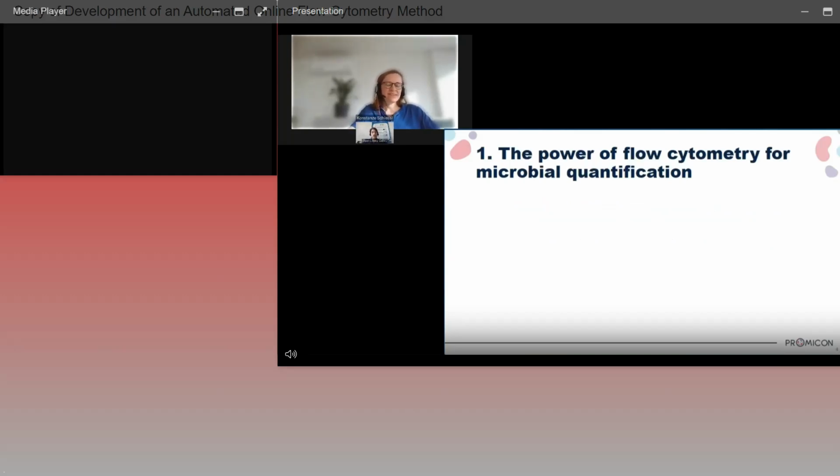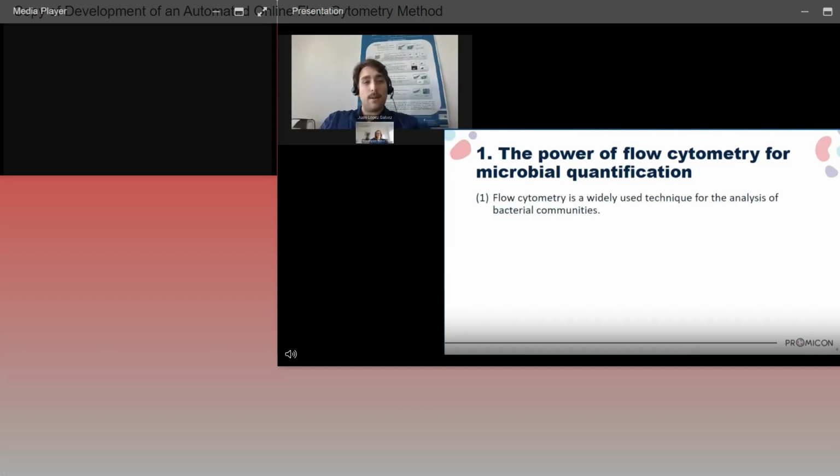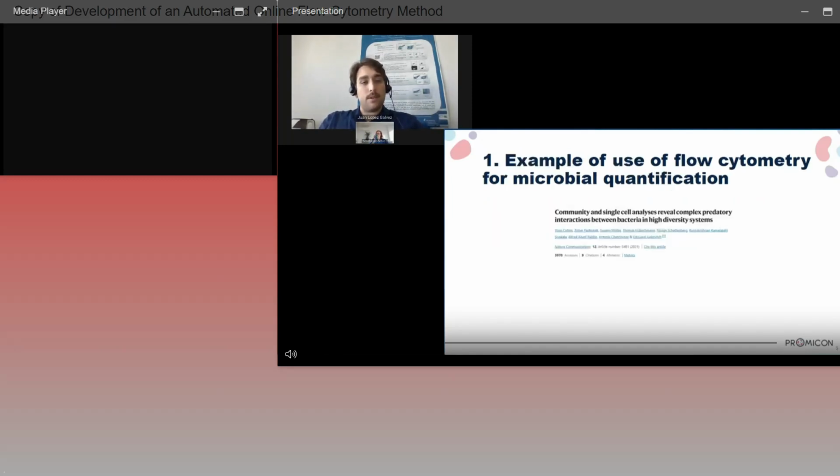Yeah, like Konstanze said, first we will talk about the power of flow cytometry for microbial quantification. Flow cytometry is already a technique that is widely used for the analysis of bacterial communities, both artificial and synthetic. And there are several papers and study cases in which this technique was used to determine ecological variables of bacterial communities. And I would like to give you some examples about this.